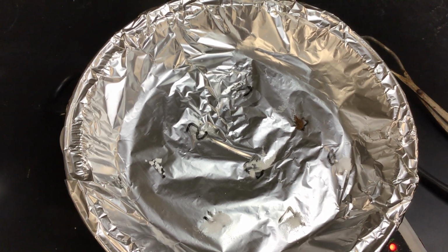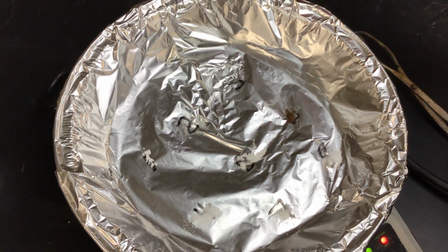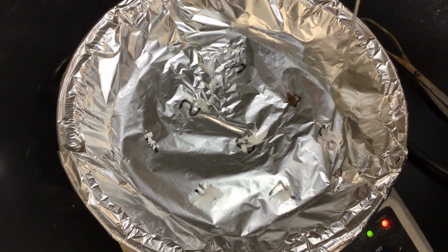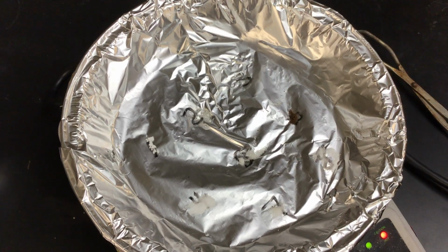I know you're waiting patiently. So we've got it. After 3 minutes, we'll decide which ones have melted and which ones have not. And I see smoke coming off of one of them. Smoke is coming off of number 3.